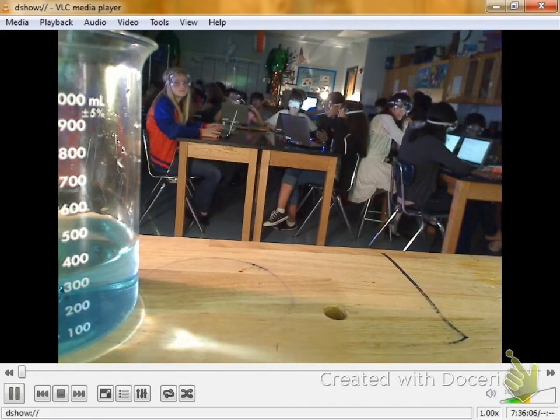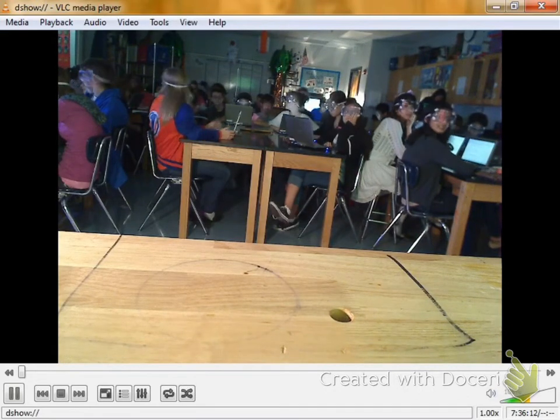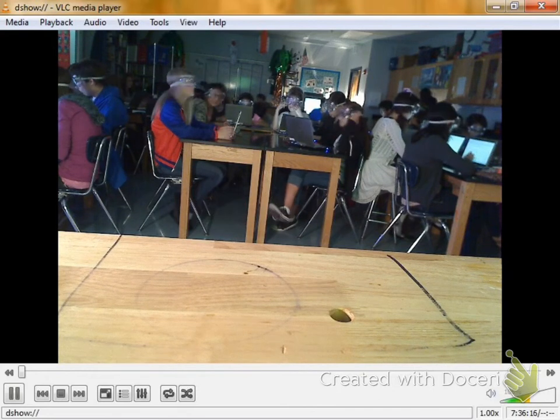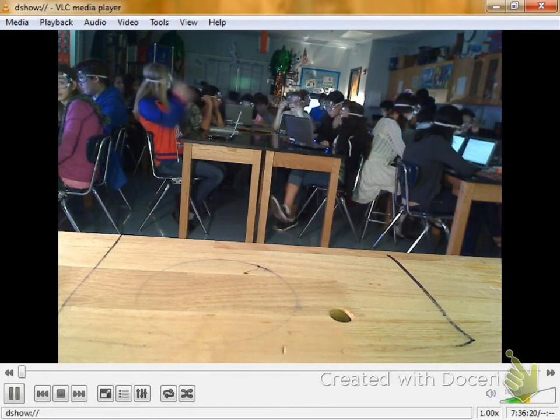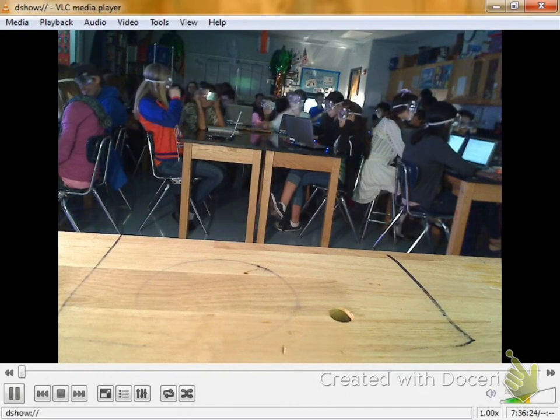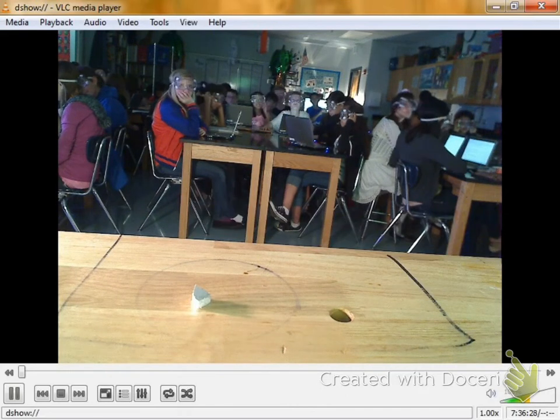What element is below lithium? Sodium. Alright, now we're going to need to cover our ears.